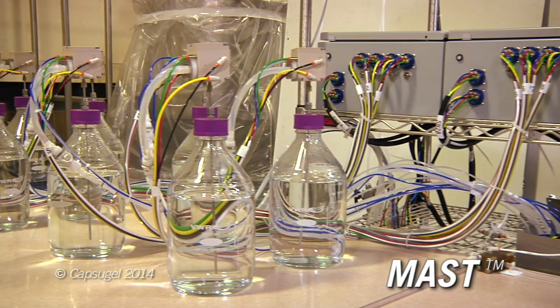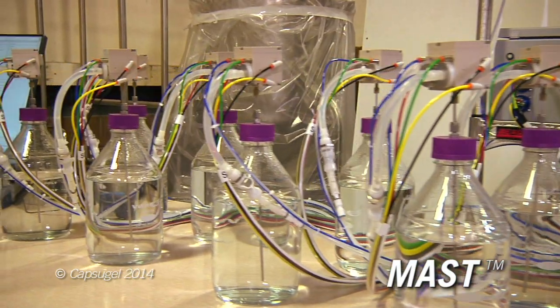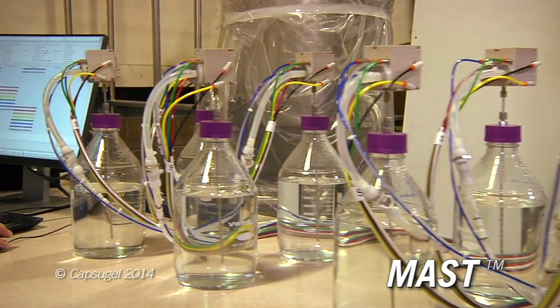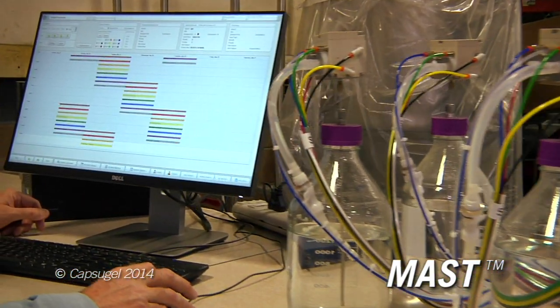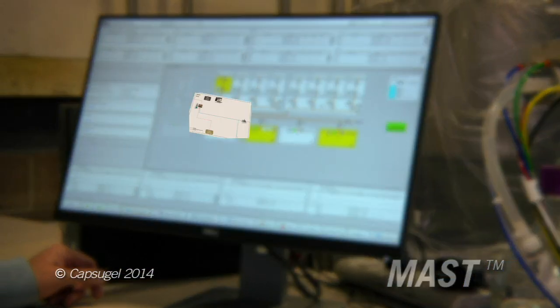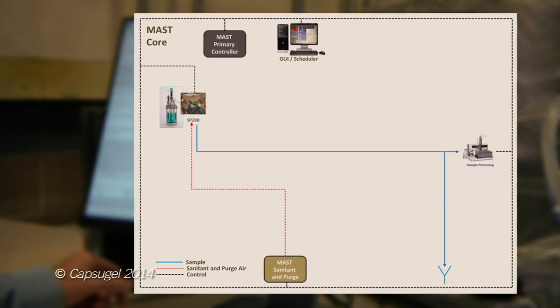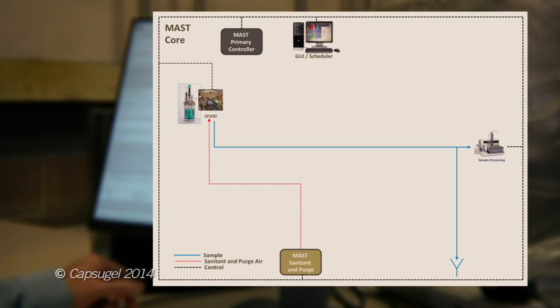The MAST system is more than a sophisticated, shiny bioreactor valve. It is a complex series of modules allowing automated sampling from eight bioreactors to multiple downstream analytical devices. MAST is truly a modular system designed to allow the customer to buy only what they need. The MAST core represents the base modules needed to collect a sample from one bioreactor and send it to one analytical device.